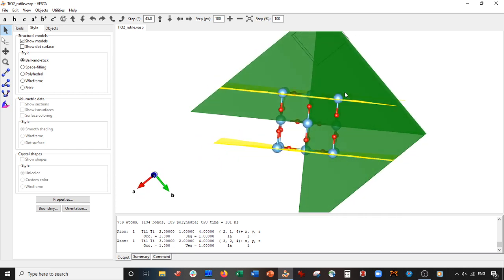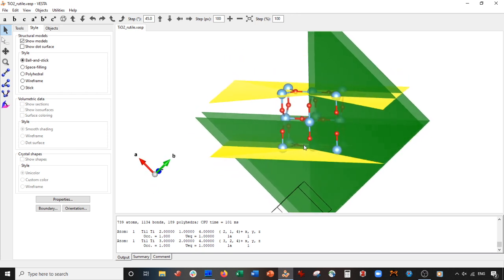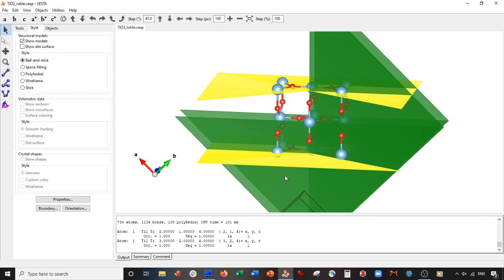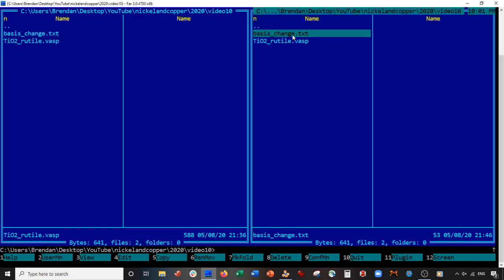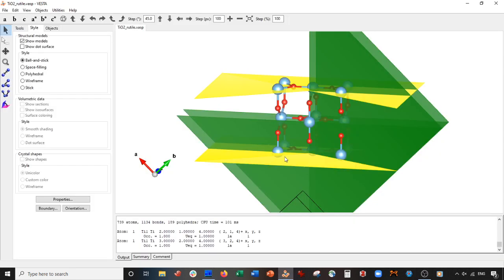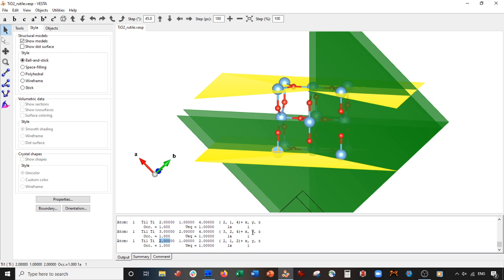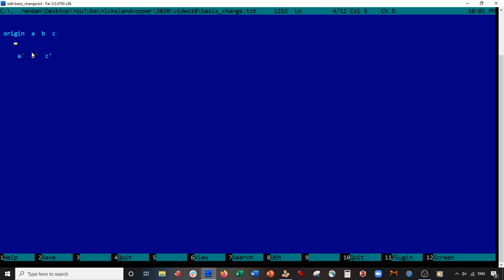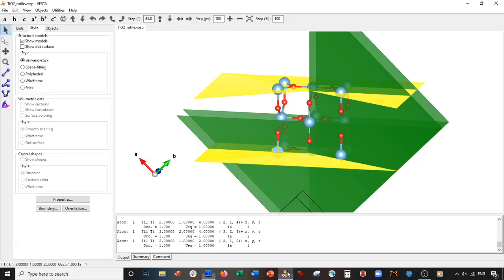Now we need to get the basis transformation vectors from this structure. What you do is go to your computer and make a text file — I called it 'basis change.' I have some setup that looks like this, so please pause and set this up in a text file, then resume. Now go back to VESTA and click this corner atom to get the coordinates from it. The coordinates are 2, 1, 2. Go back to your file and set the origin as 2, 1, 2.